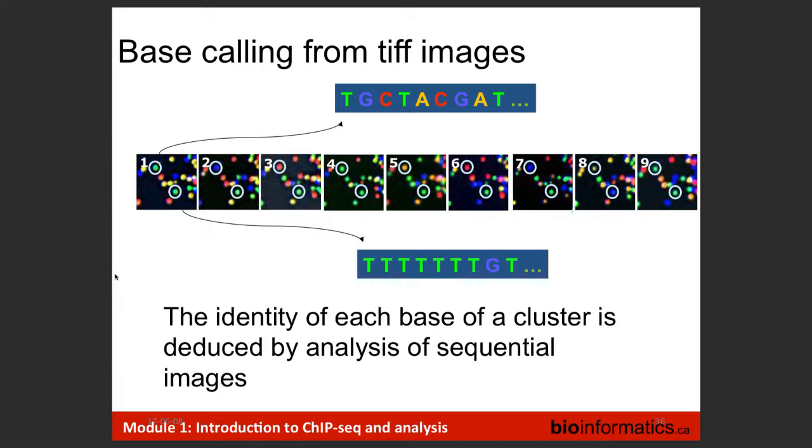Another question. You said to make this focal map, you use 25 cycles. That means, is it simultaneously you're reading the base quality and also generating the focal map? Or are you refining the focal map over the first 25? The first generations of the Illumina instruments, I think it used the first five images. Maybe the first one was probably the first image. But they found that the quality of the position, as you can expect, these things have different sizes. Some of them are closer to one another than others. You get bleed through. You see that this one's a big one, but you've got these little small ones over here. So there's a lot of little nuances that occur in generation of the focal map.